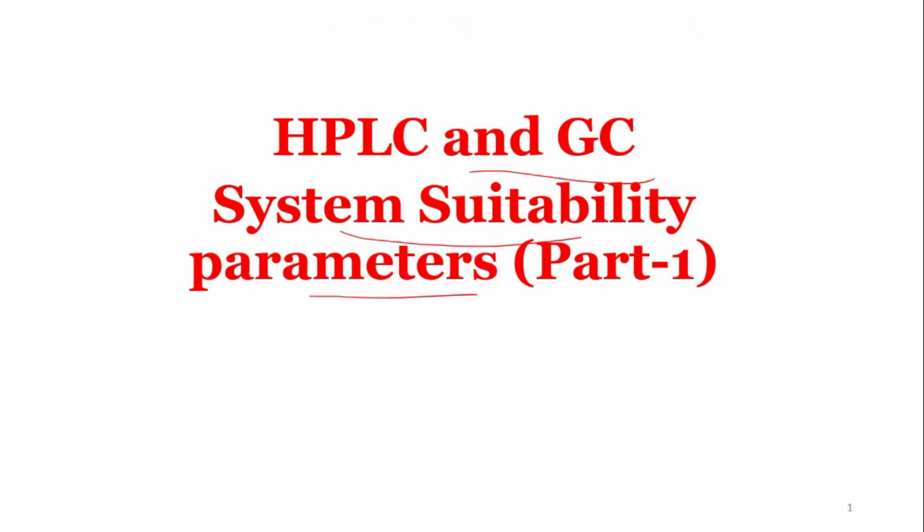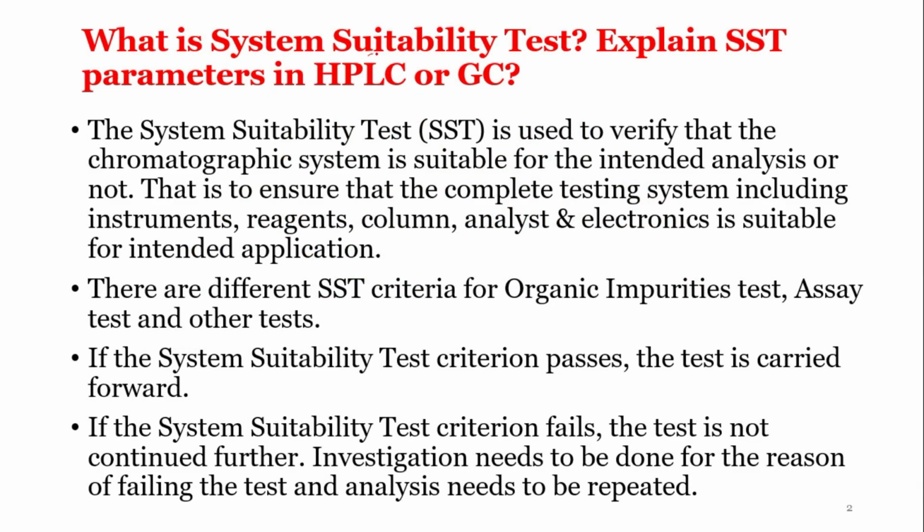So we will first see what is the system suitability. So here, what is system suitability test? Explain SST parameters in HPLC and GC. So this is the first question they will ask you, that is, what is system suitability test. Here I will not just read out all the questions or all the answers. I will try to make you understand the basics. If you understand the basics of each and every question, you can explain in any way, even if the interviewer tricks the questions or asks them in some different way, so you can easily explain those questions.